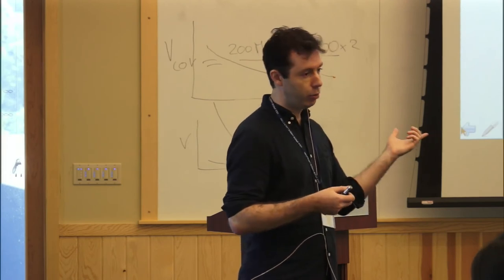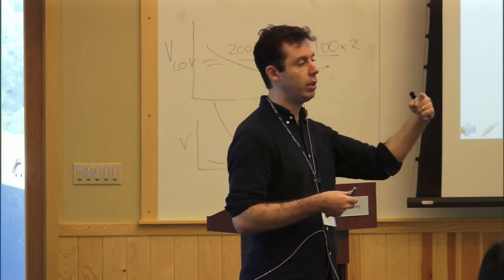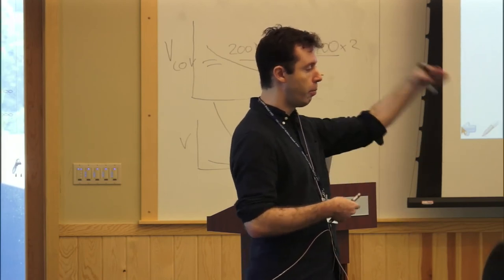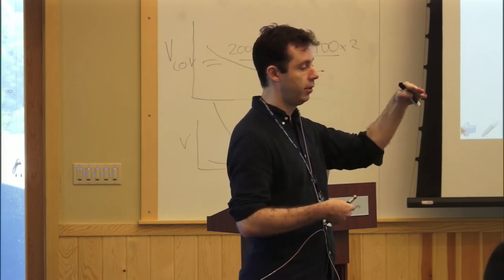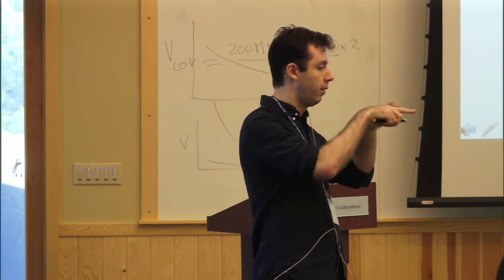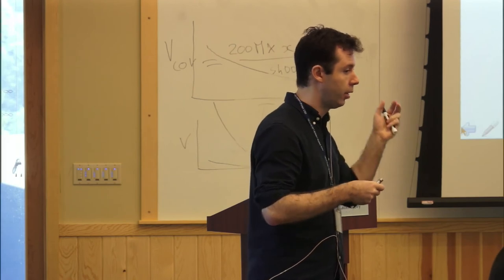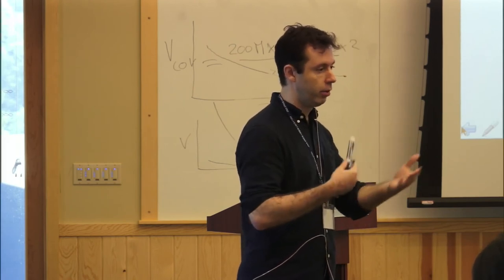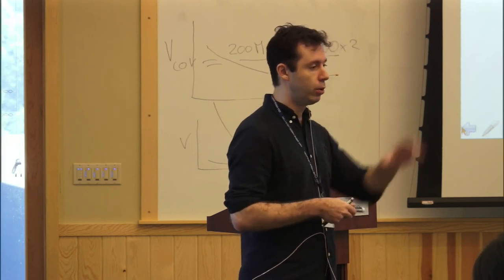Right. So clone reads are PCR duplicates, basically. These are reads that, at least when it comes to high-throughput sequencing, after mapping, would map at the same position. If you have two reads that map at the same exact position in the same orientation, these would be called PCR duplicates or clones. Again, there are multiple ways to deal with those. Typically, what you do is collapse them into one.